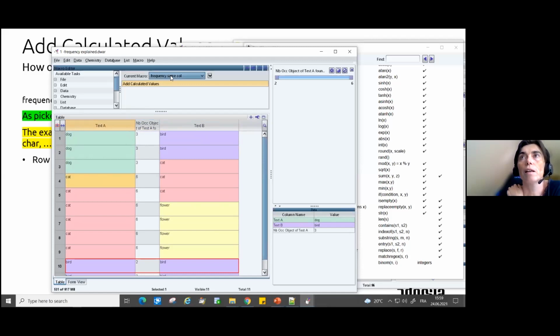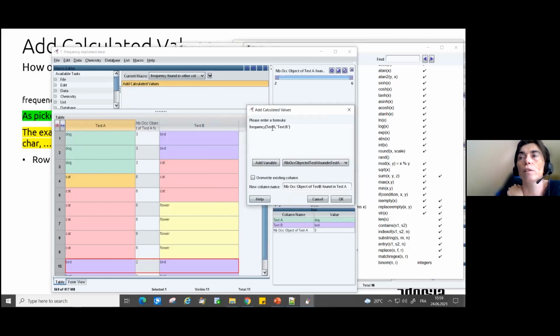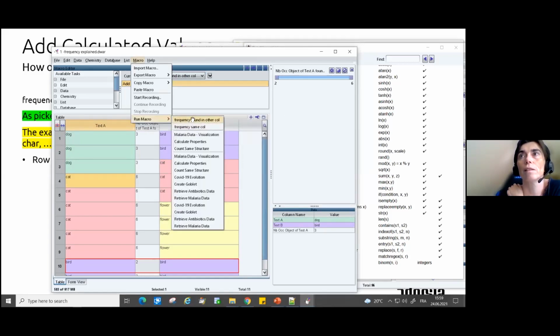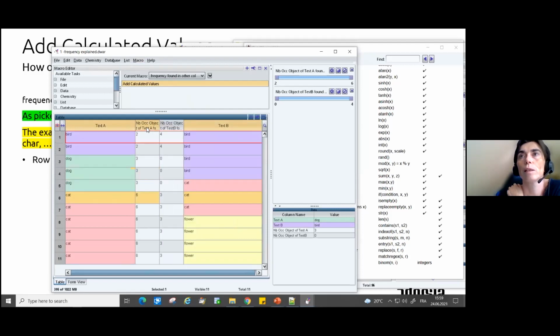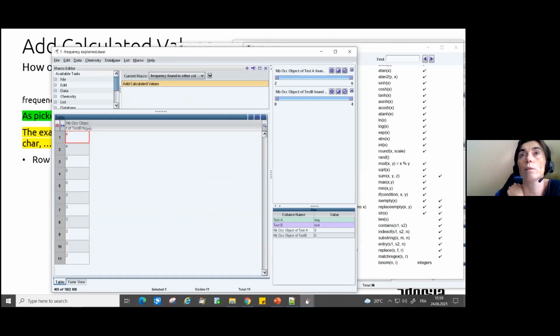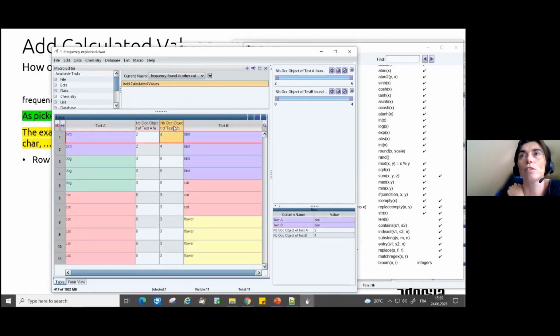Now there is this other syntax where you can say, okay, I'm looking for something which is in text A, so I'm looking for a dog, but I'm looking for this particular value in another column, text B, in this example. So if I run this one, and I will hide this column. So I right click and hide selected column. Sorry, not good. Show the selected column. I just wanted to hide.